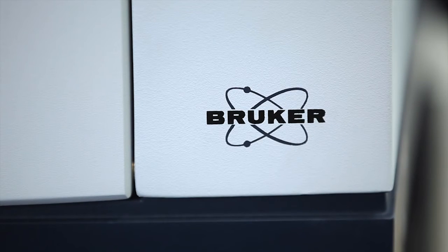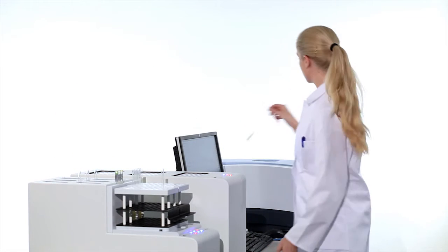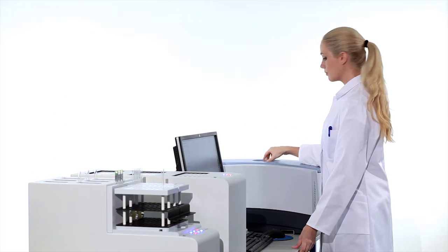Over the past four decades, Bruker's MINISPECT has widely substituted dilatometry in quality control due to its simplicity and superior repeatability and reproducibility.